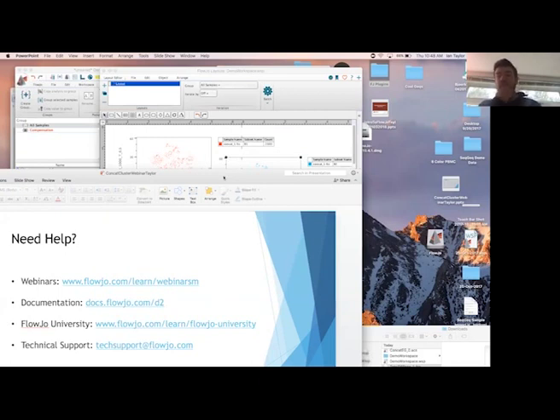How to avoid it? That's a tricky one. If you have a workspace that's continually recalculating tSNE, you could send that to us. We're always happy to take a look at specific users' data.